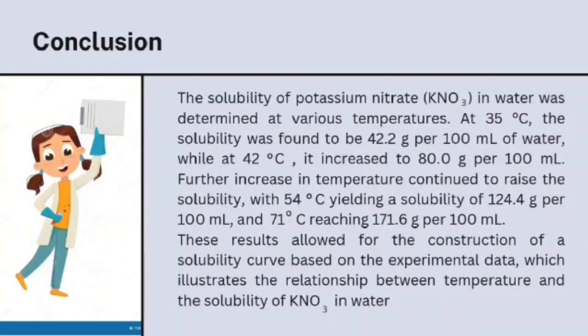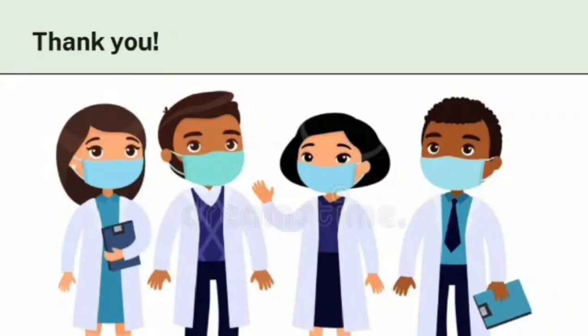This result allowed the construction of a solubility curve based on the experimental data, which illustrates the relationship between temperature and the solubility of KNO3 in water.